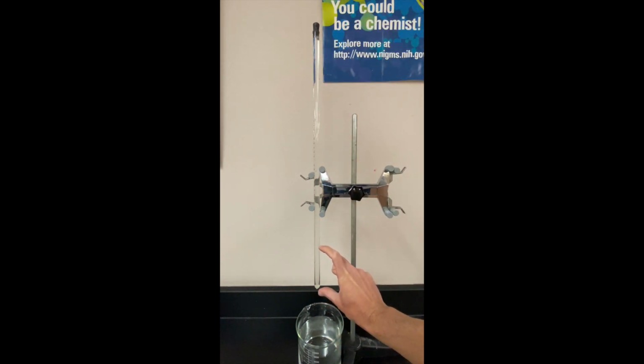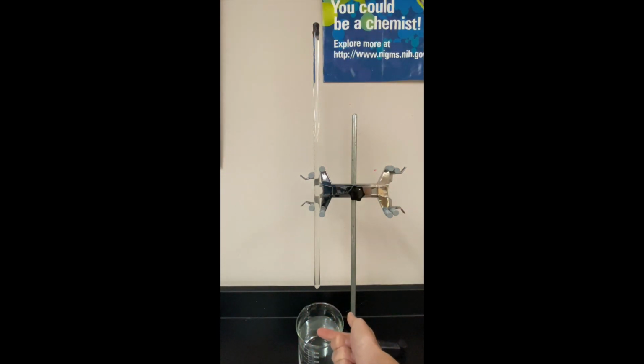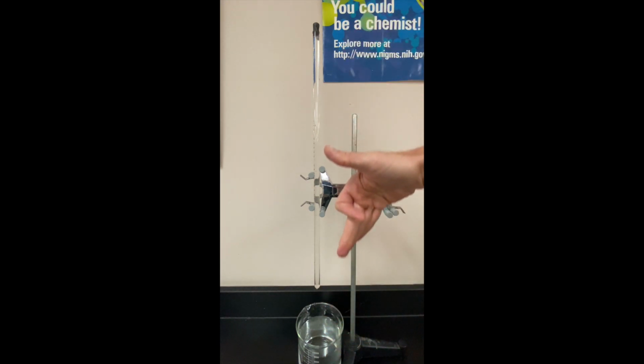10 milliliters of the 3 molar hydrochloric acid is at the bottom. The rest of it has been filled with water, and then it's been capped off with the rubber stopper that's holding the magnesium ribbon. When I invert this and turn it over and submerge the rubber stopper underwater, that'll prevent the water from coming out, but also the hydrochloric acid is more dense. So it will actually migrate down when this has been flipped over, and it will begin to react with the magnesium ribbon. And you'll see that as bubbles. Those bubbles will then float to the top of the eudiometer and be collected.